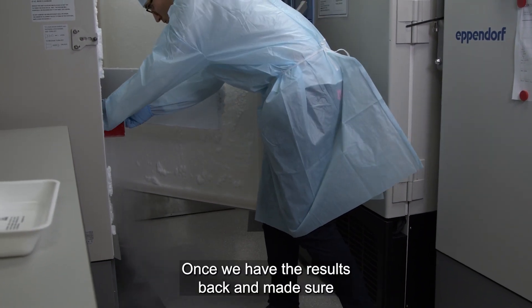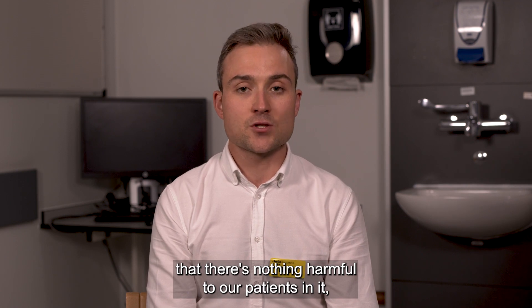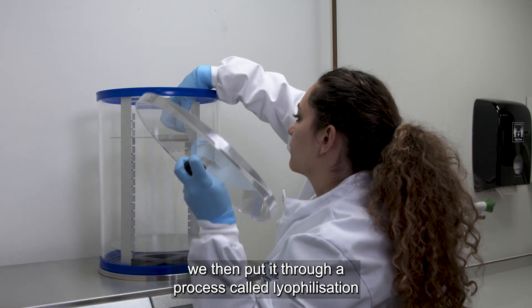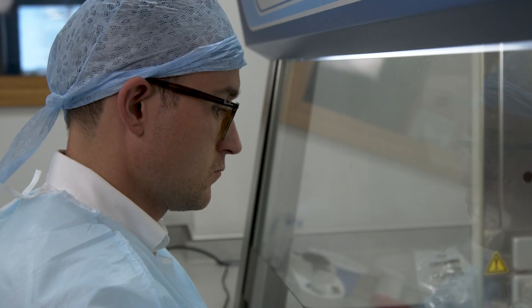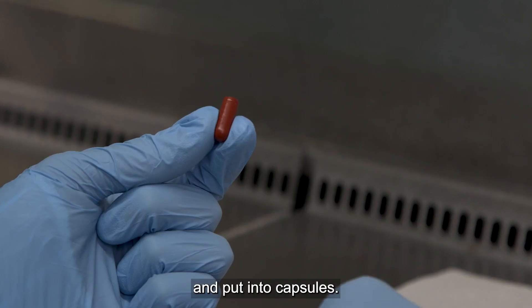Once we have the results back and confirm there's nothing harmful to our patients in it, we then put it through a process called lyophilisation, or freeze drying. This removes about 90% of the water, leaving us with a powder which we can then break up and put into capsules.